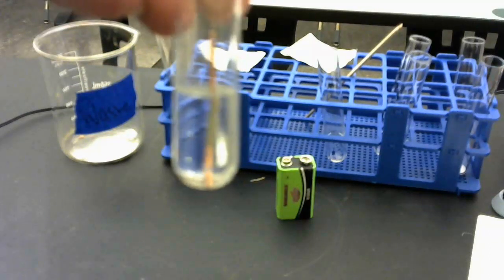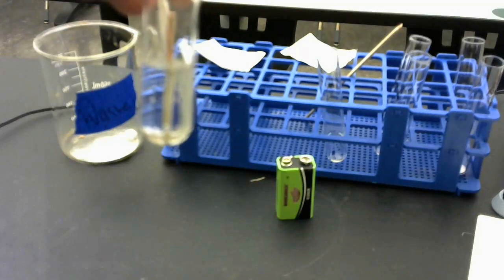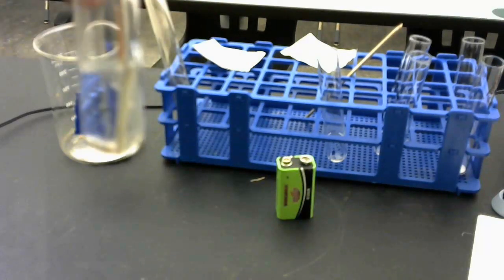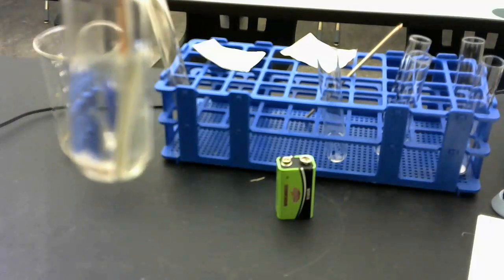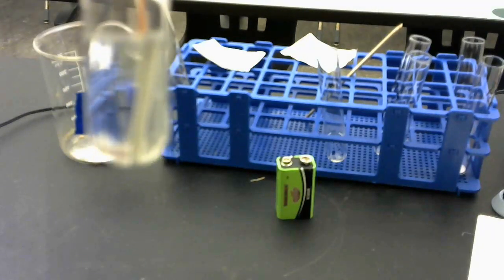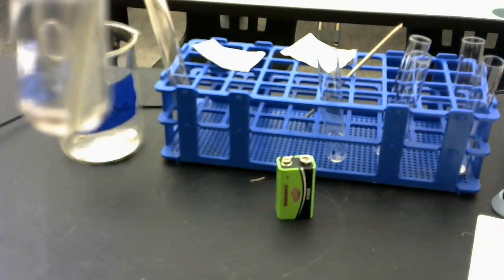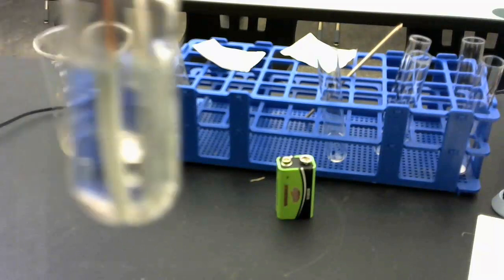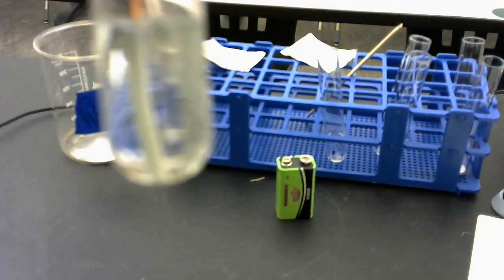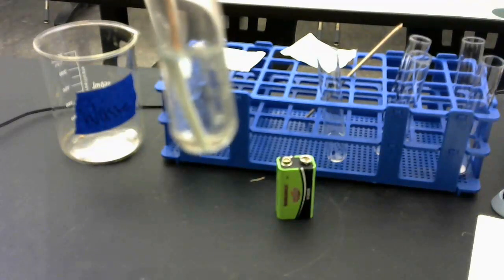Okay, so this is my copper and my AgNO3, and I'm going to let that react a bit, but you can see it immediately. You can see all of a sudden there's what looks like bubbles, but it's not bubbles. It's actually a solid that's forming on the outside of the copper, okay? So it's a solid that's forming on the outside of the copper.